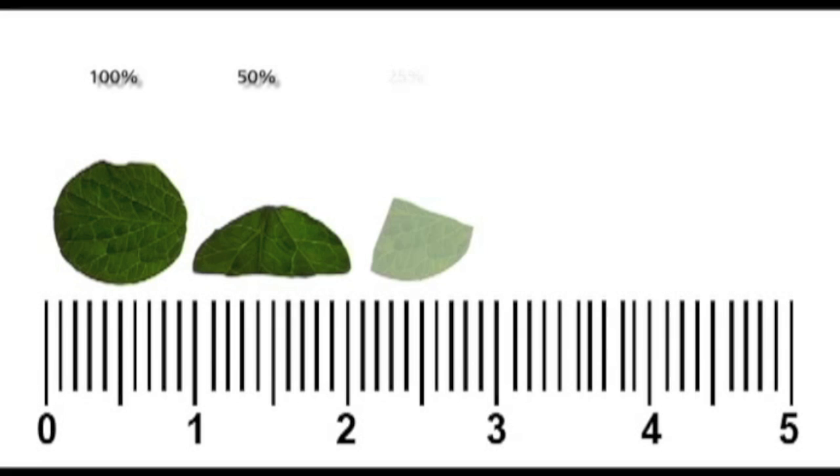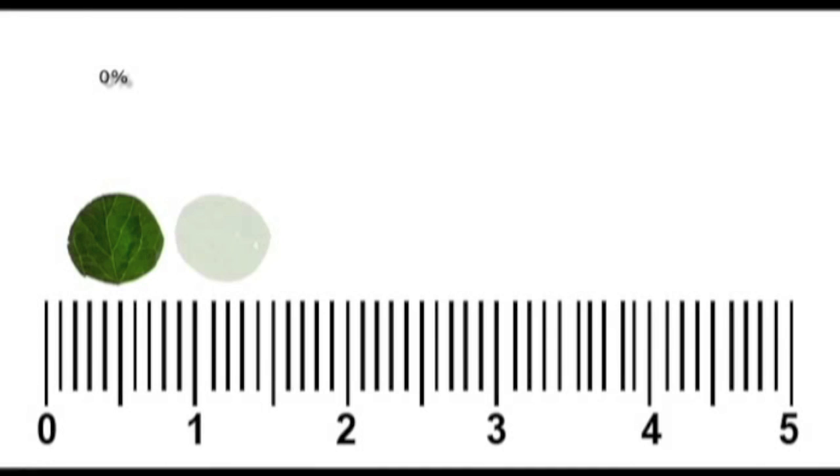For example, the first image corresponds to zero percent rating in leaf damage. The second image corresponds to 0.5 percent rating in leaf damage. Images three and four show foliar discs with approximately five percent and eight percent leaf damage rating respectively.